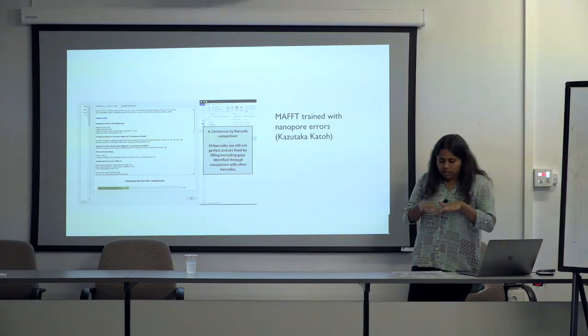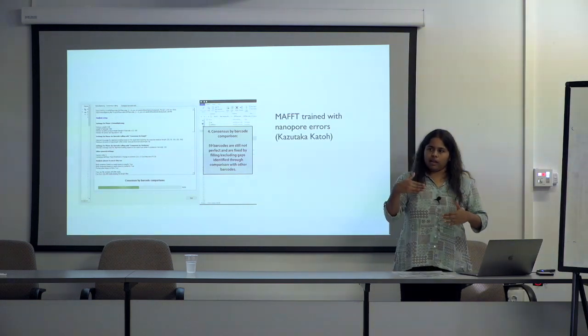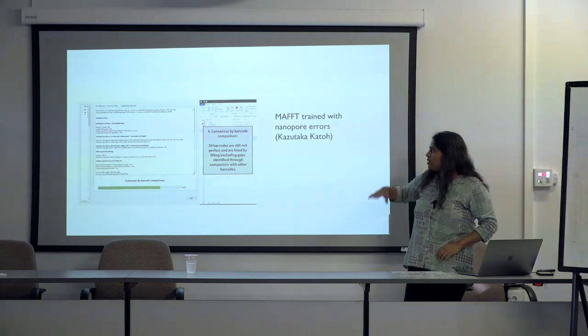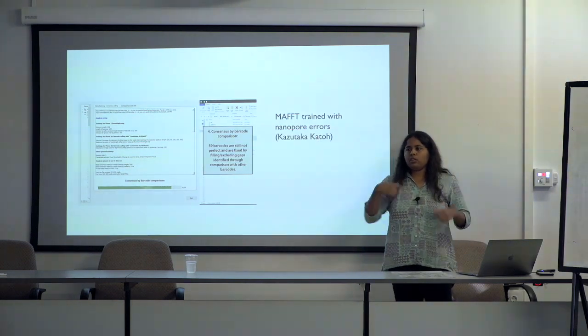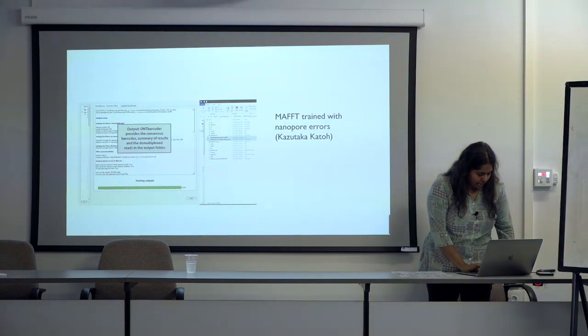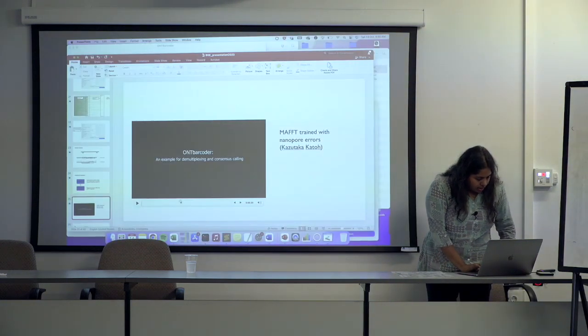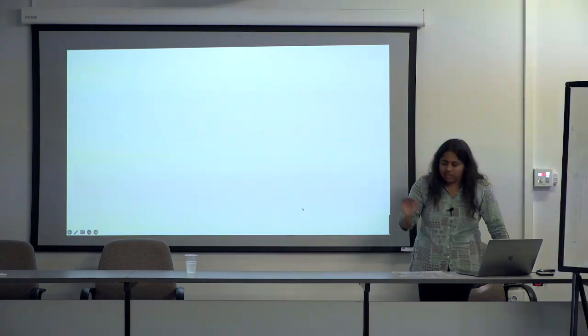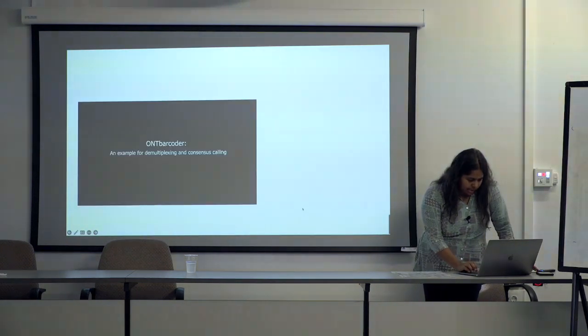So we improved the initial consensus based on some similarities. So basically you have an initial consensus based on length, you map your reads back onto them, you improve the basis based on similarity to the first consensus. And this is basically what leads to the consensus by similarity settings.